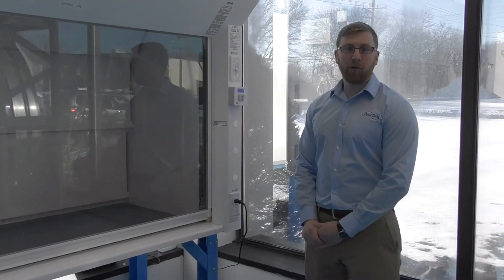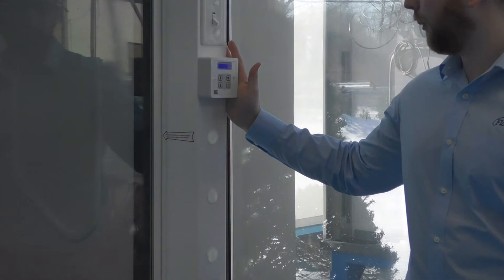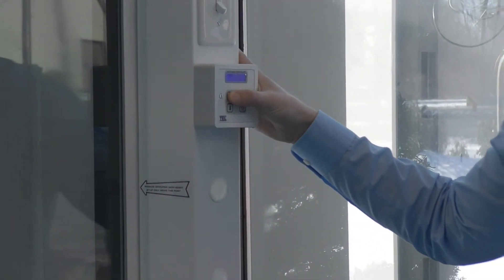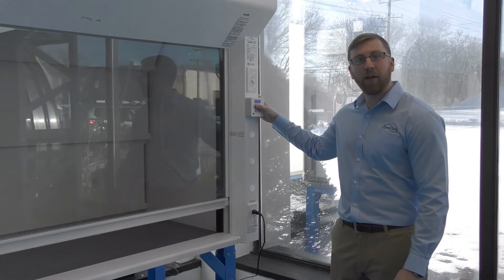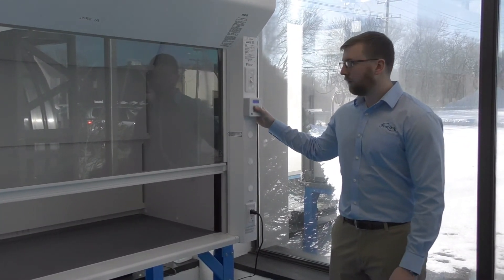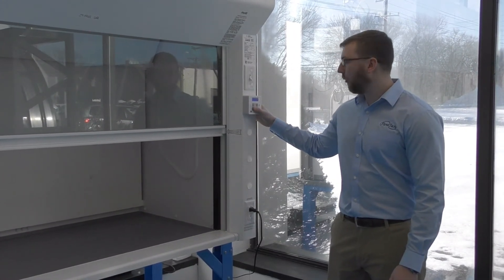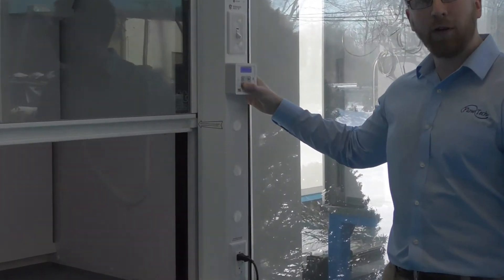The other way to open and close your sash is to use the fume hood display controller mounted on the fume hood. You can simply press the up button and your sash will go to its designated height. And as long as the user is present, you can also put the sash down by pushing the down button.